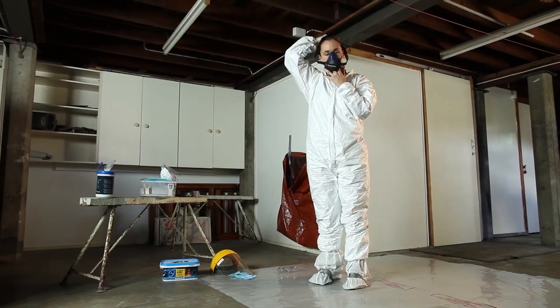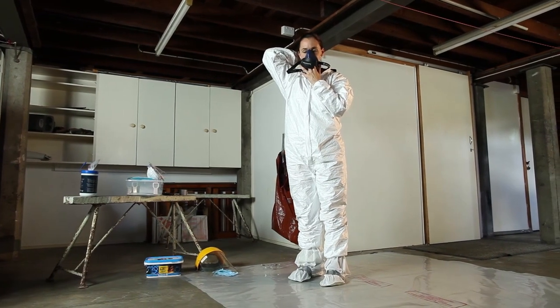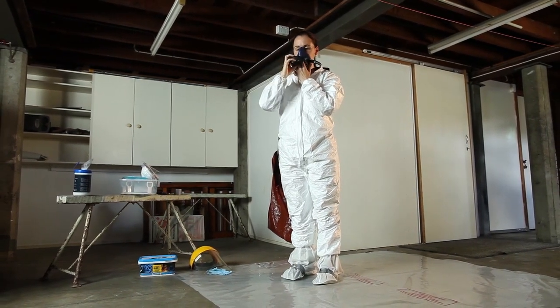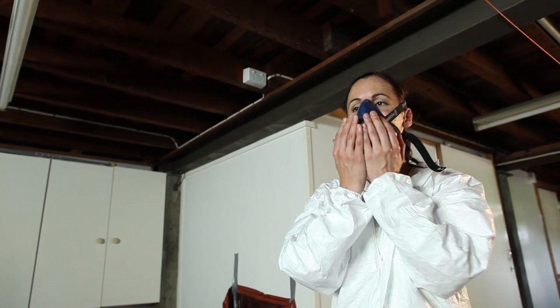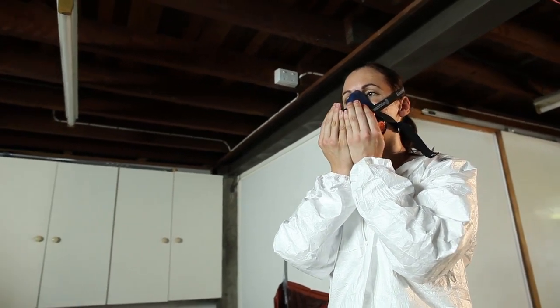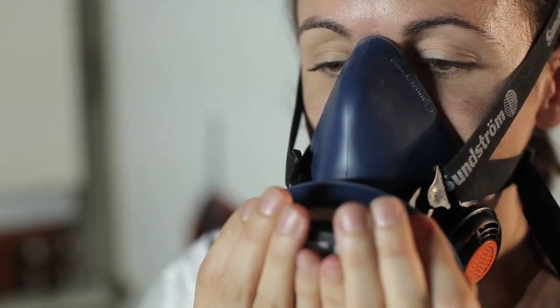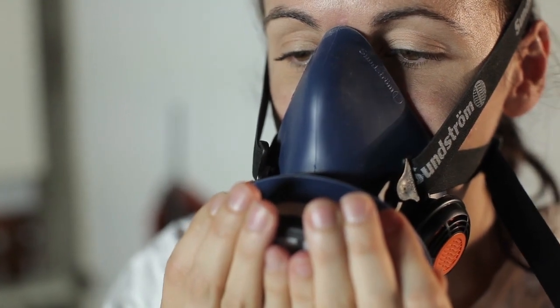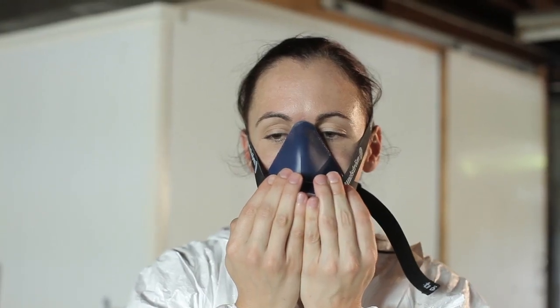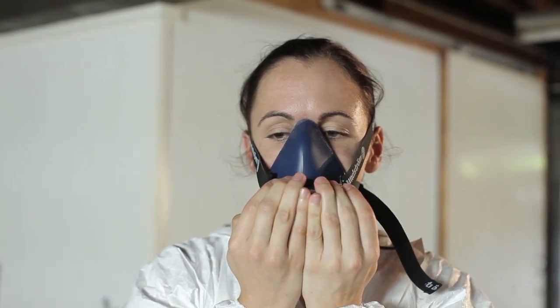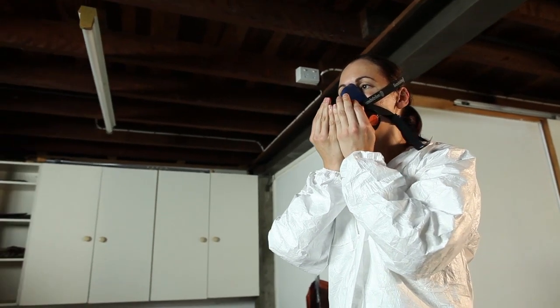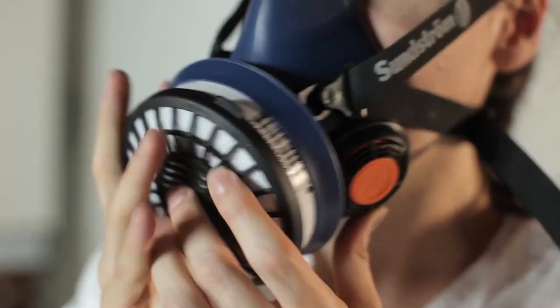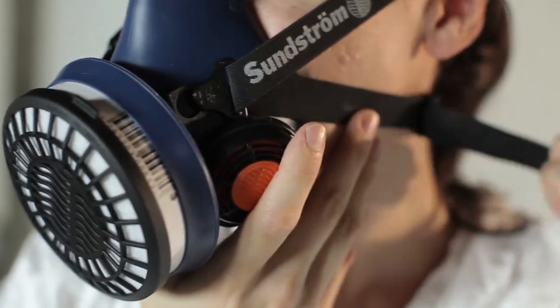If you're using a reusable respirator that does have a valve or cartridge, or a disposable respirator that has a valve, place a hand over each cartridge or on the valve and take a quick deep breath in. If it is well sealed, the respirator will collapse slightly inwards and you won't feel any air passing between it and your face. Any detected air leaks should be corrected by repositioning the respirator and checking again.